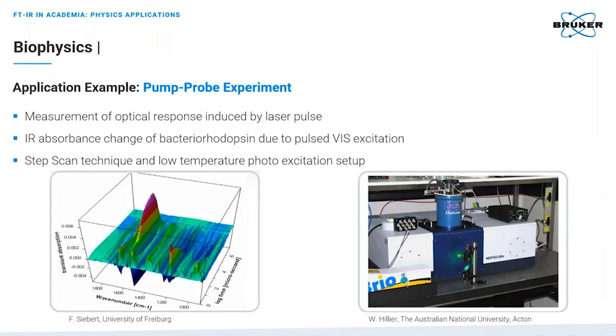One typical time-resolved step scan experiment is the so-called optical pump probe spectroscopy. A pump probe experiment utilizes two light beams, a pump beam and a probe beam, that interact with a sample material. The pump beam initiates a sample response. A probe beam monitors the response, usually with a lower optical intensity that does not significantly affect the sample. In the well-known pump probe experiments, both the pump and the probe beams come from a single beam of laser pulses that is then split into two parts. This type of pump probe experiment is well suited for measuring the lifetime of electronic excitations with femtosecond time resolution.